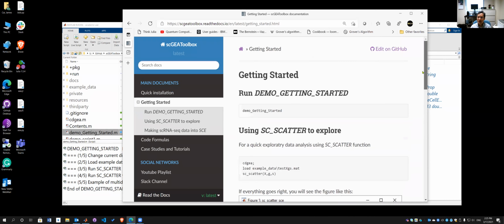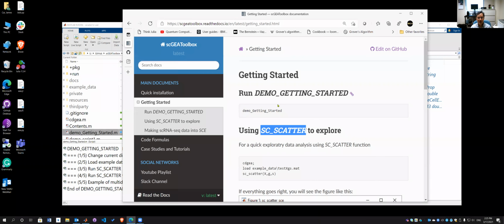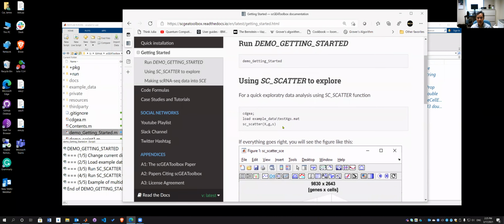I think that's about the application of this scatter plot. I try to sell this to you because it's very easy to use. You have a nice interface. You can do a lot of exploratory analysis on it. So since last week to this week, I'm trying to show you this. Okay. So I will give you 3 or 5 minutes to try this out. Make sure you understand each step.